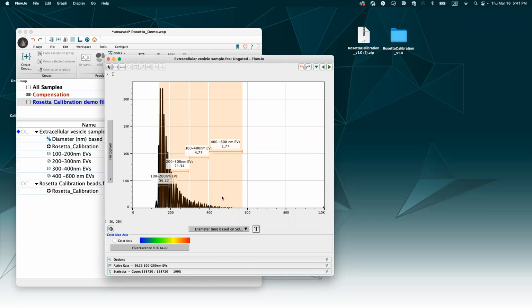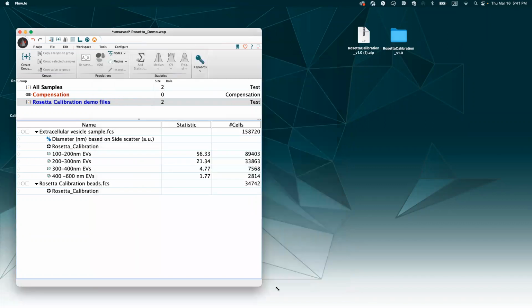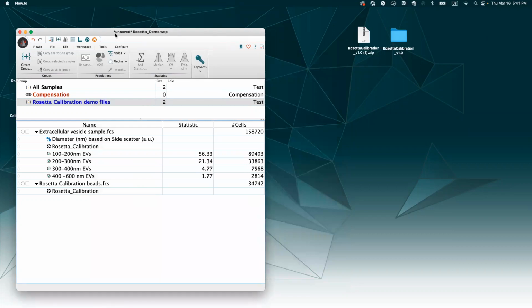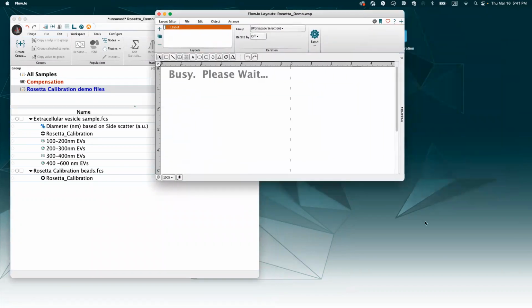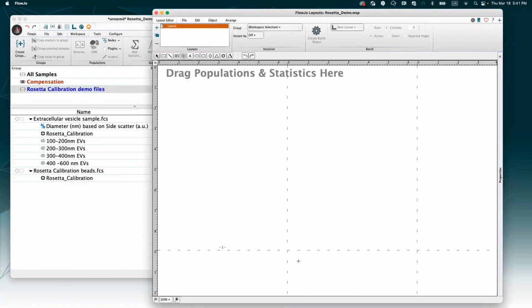So, you can continue and do this for all of the rest of the samples, or set different kinds of gates. And the next step really depends on what your workflow is going to be. Something useful that you could use is the layout editor here, where you can overlay all those different populations, because ultimately we want to see differences between those in different markers and so forth.